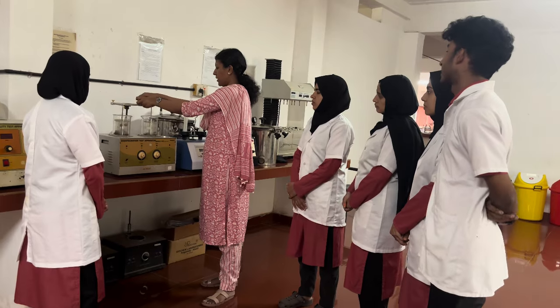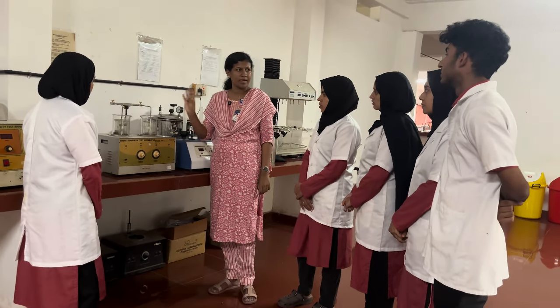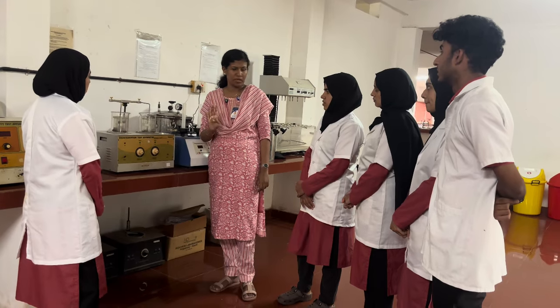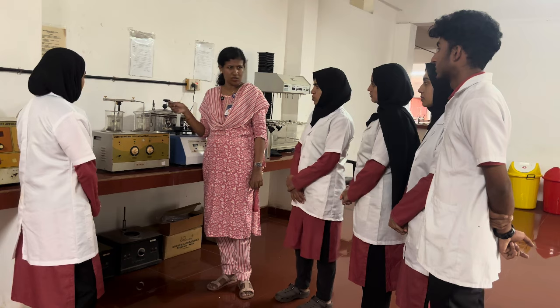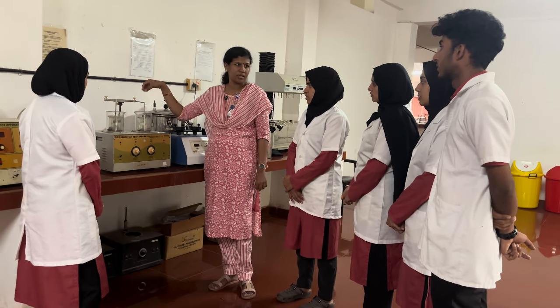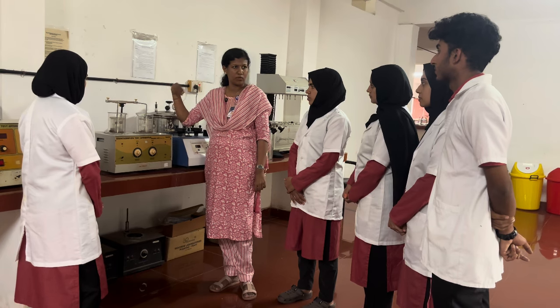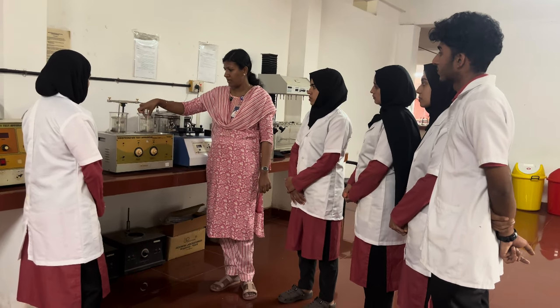Next, what will we do? At a time we have to test 6 tablets. So we will be adding 1 tablet to each of the glass tubes. Then we will add the plastic disc to each of the glass tubes to which we have added tablets.